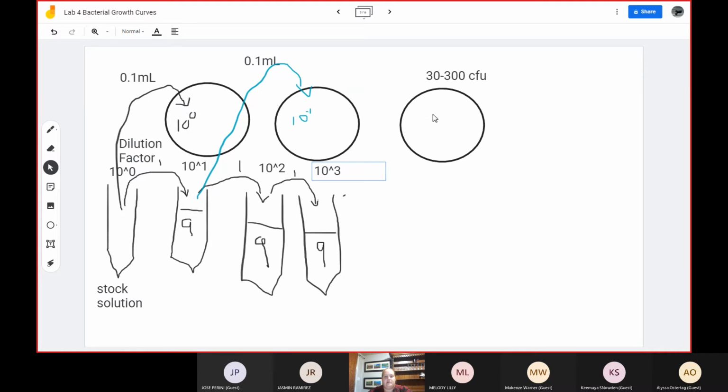And then if you did this next tube over into here, the red one, this is getting very messy. I apologize. And we would then plate this onto this plate. So we'd have 1 plate for each of the tubes that we made. It'd also be 0.1 milliliters.